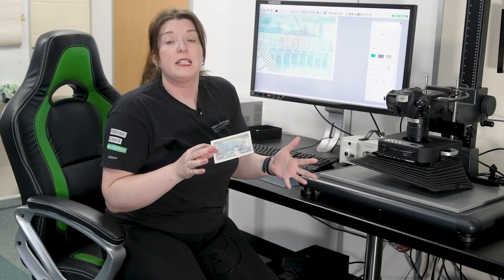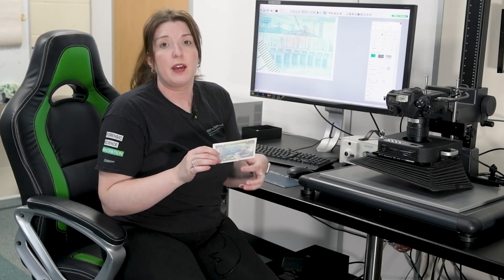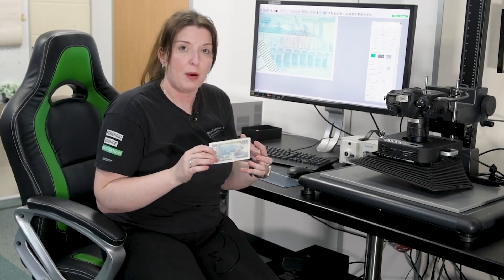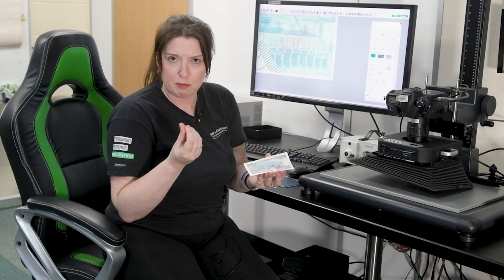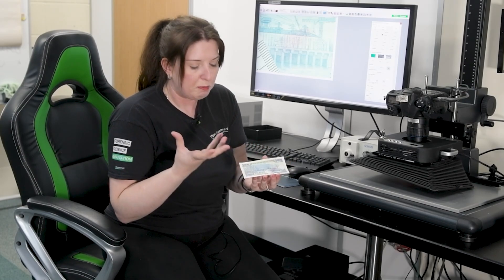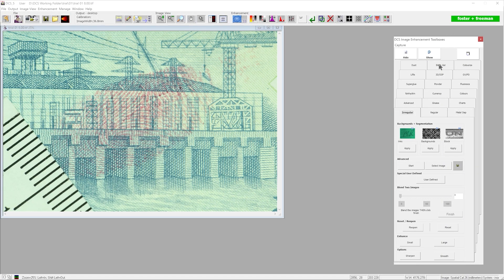So far we've done some quite simple techniques in the software — just a couple of clicks. Sometimes we can have even more challenging samples, where the software does part of the work and then it's up to us to do the final part. Here we have a Vietnamese banknote treated with ninhydrin, giving that pinky-purple colour on top of a blue and yellow banknote. We photograph that with our ring light and daylight filter so the camera can see all the colours in the image.